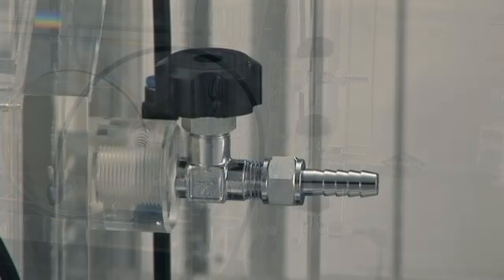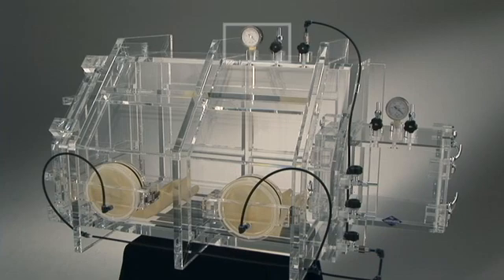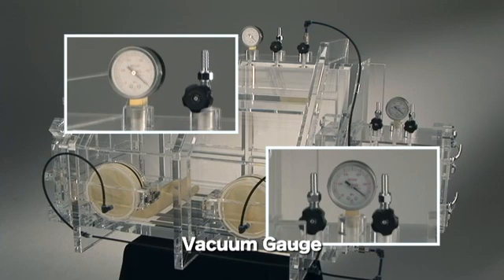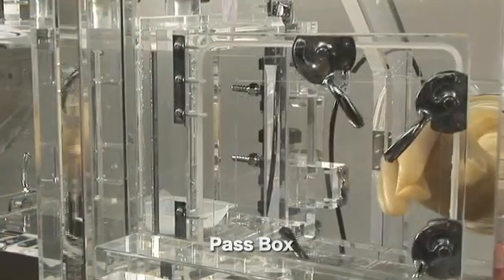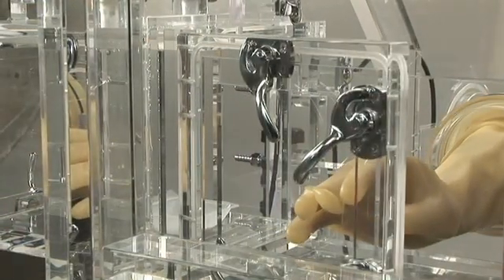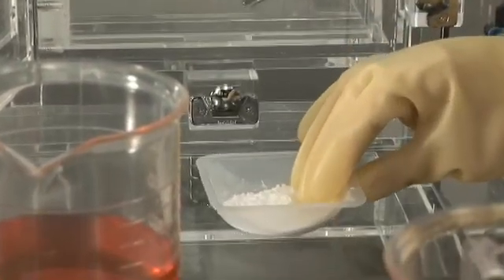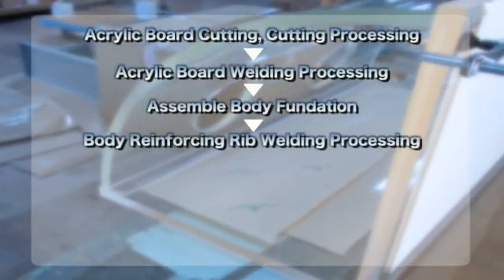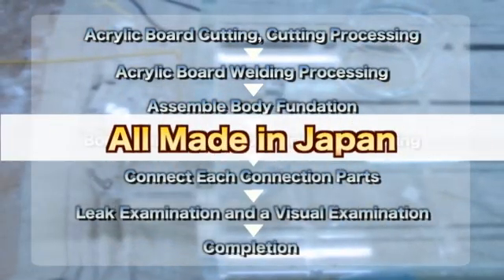Adopt the needle valve for the fine adjustment of gas replacement. There is a vacuum gauge in the main box and the pass box. You can confirm the pressure in the box. The pass box makes it possible to take out the sample while keeping the gas replacement situation. All processes are made in Japan and have good quality control.